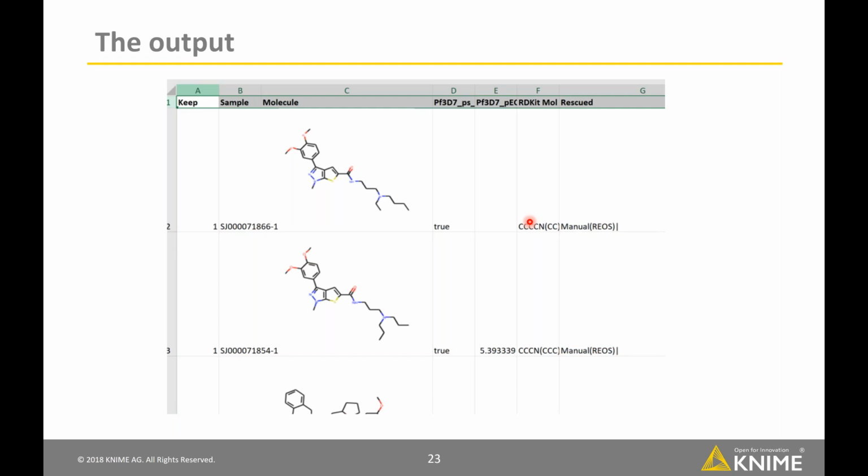Right, so we've got some questions coming in now. One says, what about picking inactives for the training? That's from Daria Goldman. In this particular case it's just looking at picking compounds for the validation assay. Deciding what to use for the training set for machine learning is a separate part of the overall workflow that's in Serina's tutorial.